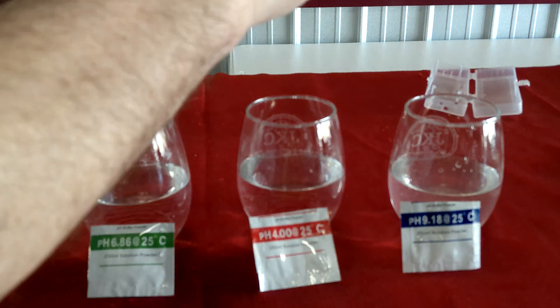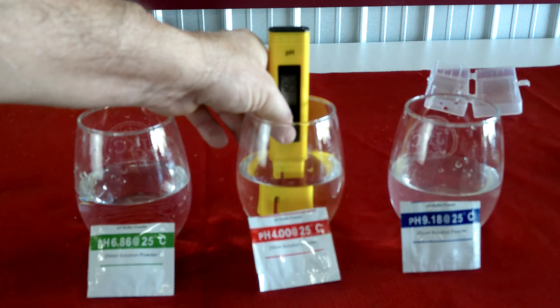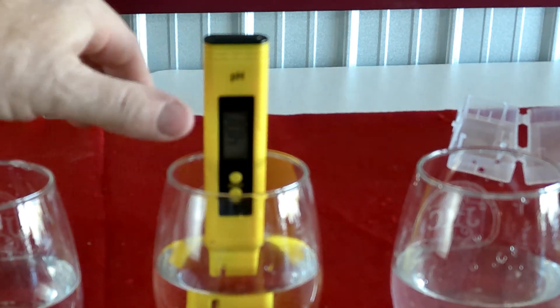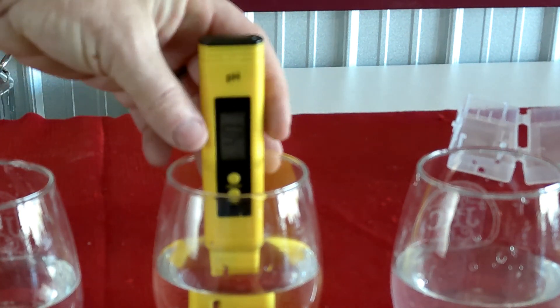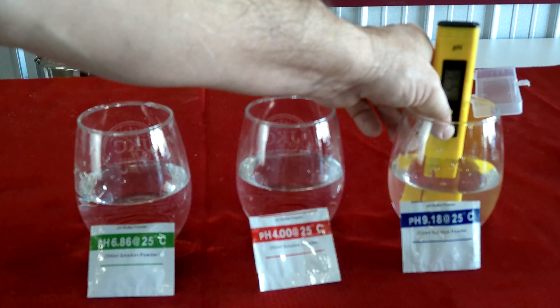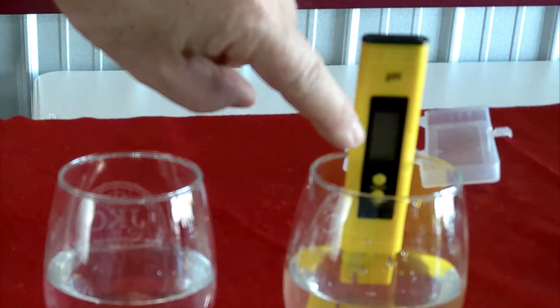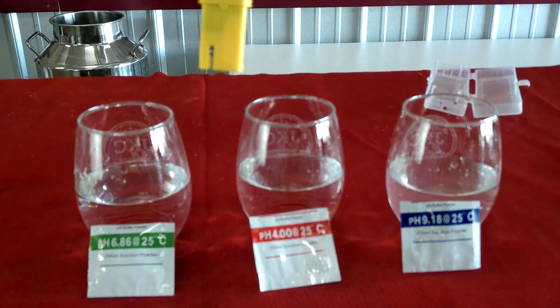Rinse the diode with some distilled water, then set it into the 4.0 solution. Hold the calibration button down for five seconds, let up, push the button in and out — it reads 4, then starts flashing. Leave it in there until it stops flashing. Rinse the diode, put it in the 9.18 solution, hold the calibration button for five seconds, let up, then press and release the calibration button quickly two times. It'll flash 9.18 — leave it in there until it's solid. Now the pH meter is calibrated.